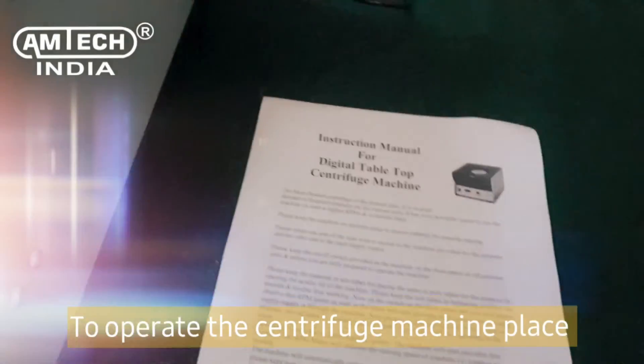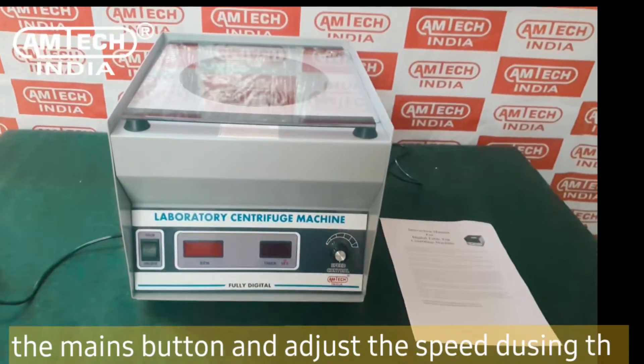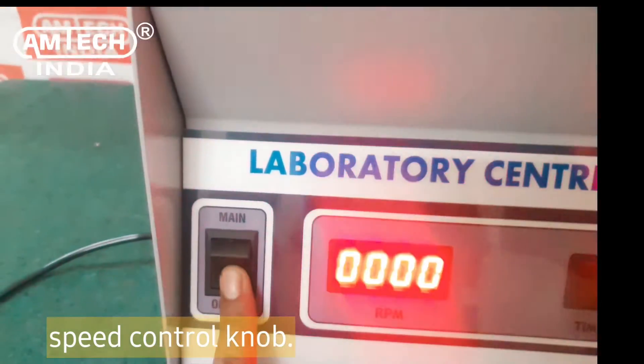To operate the centrifuge machine, place the samples inside the machine and switch on the mains button, and adjust the speed using the speed control knob.